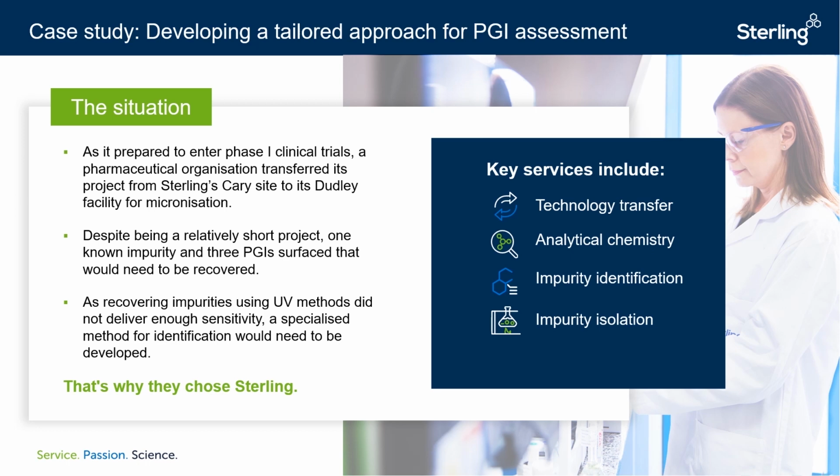After investigation via the HPLC UV method, it was determined that it was not suitable for 2 reasons. The sensitivity required for recovering all the impurities via the UV detector was not suitable, and also one of the impurities consistently had low recoveries. We decided to move to an LCMS single ion monitoring method using an electrospray ionization source.